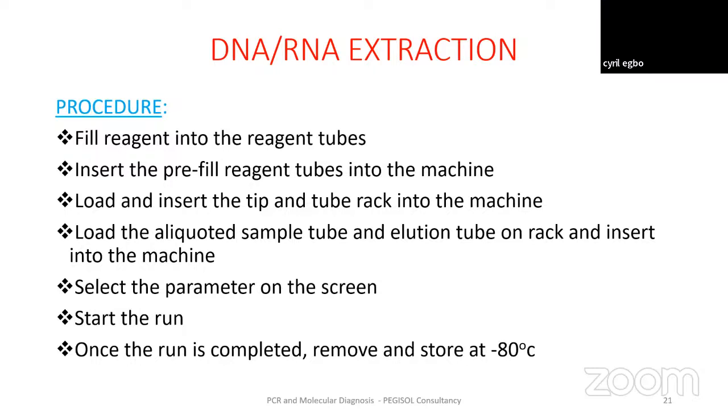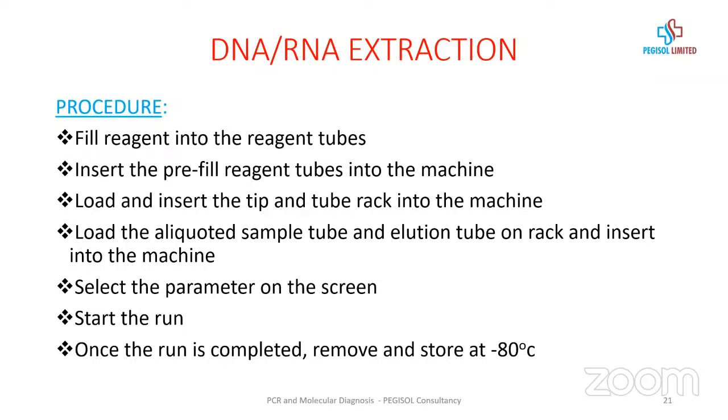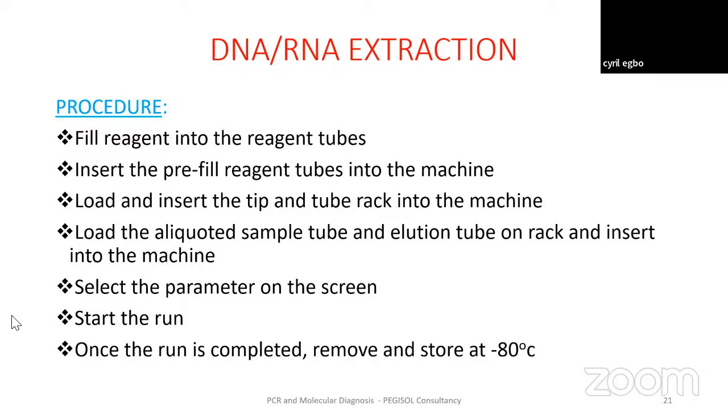because there's some inbuilt software inside that does this calculation of the concentration in the machine. So this is actually the end of DNA extraction.